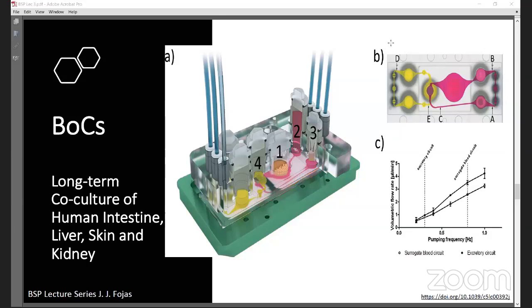Okay, so essentially here, what the authors did include integrating preformed human intestine and skin models into the 4-organ chip on standard cell culture inserts at the size. I think the size here is 100,000-fold smaller than their human counterparts.